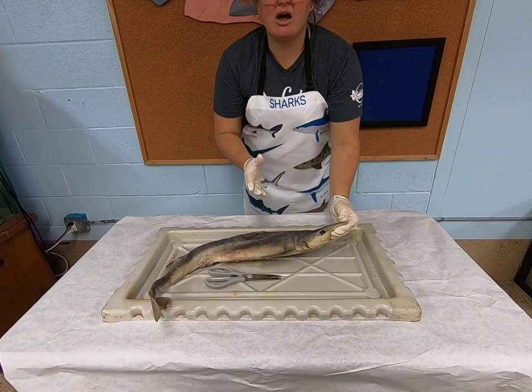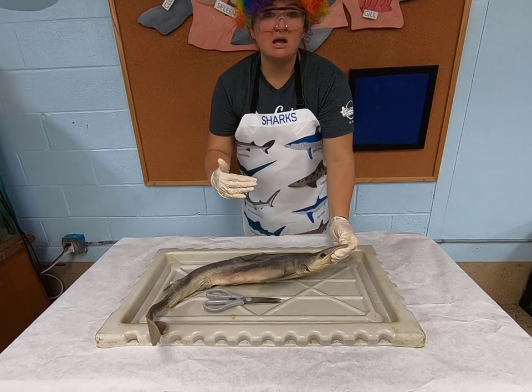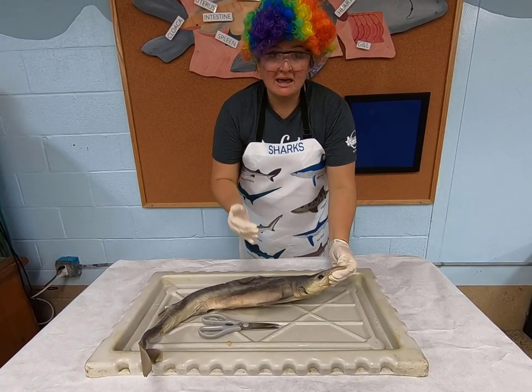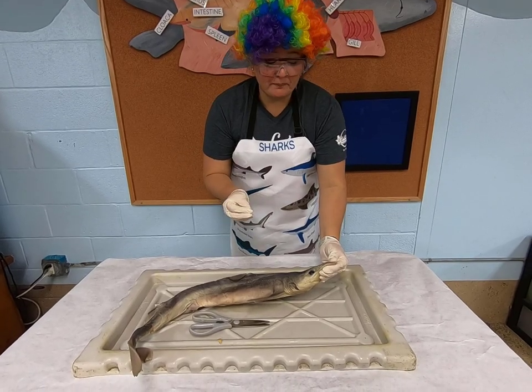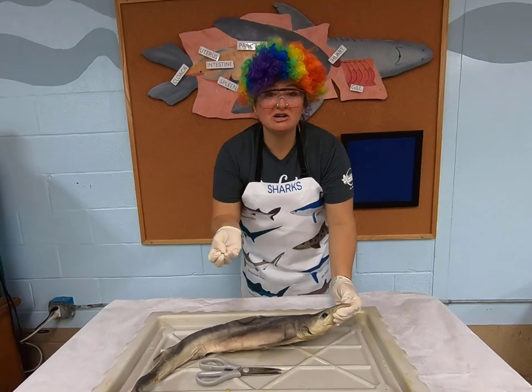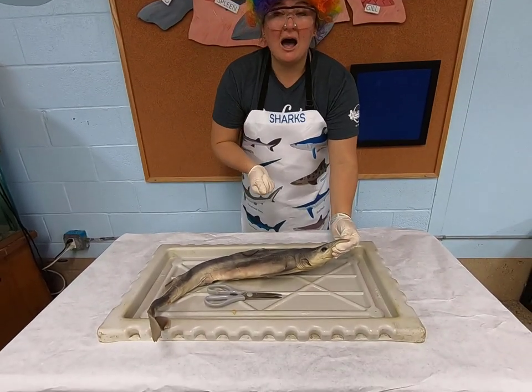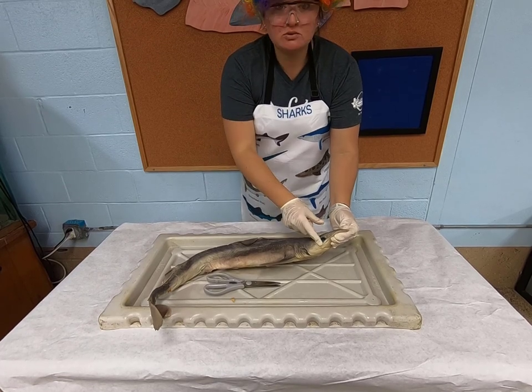They have night vision. They have this thing in the back of their eye, a silvery little layer called a tapetum lucidum, that actually reflects the light so they can see in the dark. Think back to your cats or raccoons or deer that you flash a light in their eyes. You'll have this kind of green glow coming back. Sharks will do that as well.